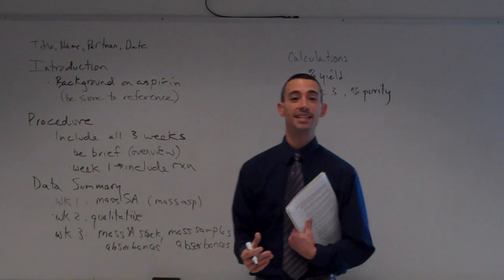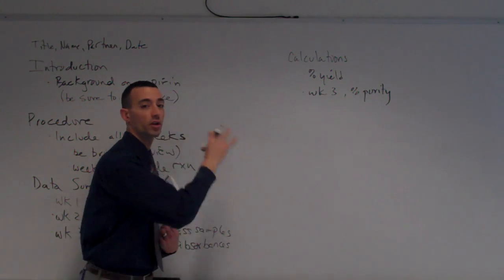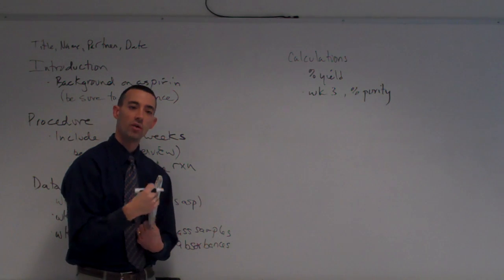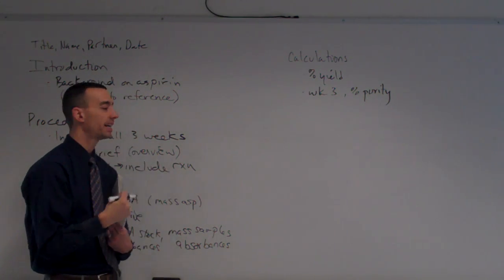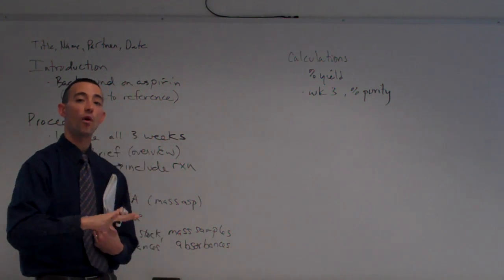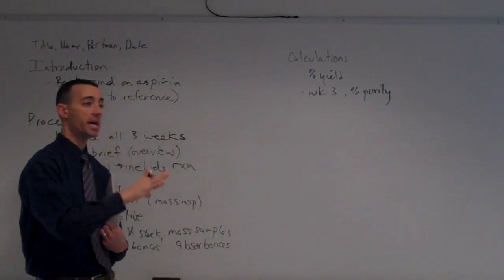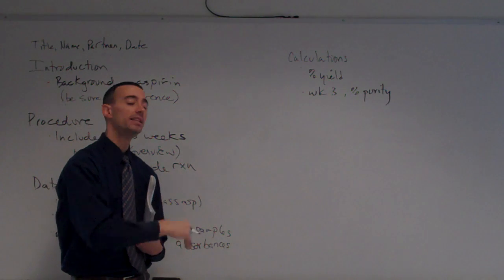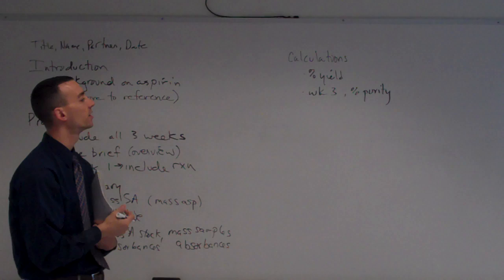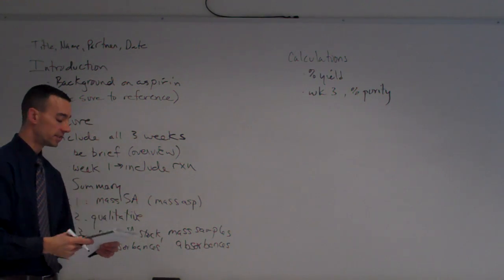Either show them in the data template, or again, if you're going to use the Excel table that we just generated, you can show separate formulas, okay, and examples for any one of your trials. Please, you don't have to do it for all of the trials, but take for example, the raw, take that all the way through from start to finish as an example, showing the reader how you did that.